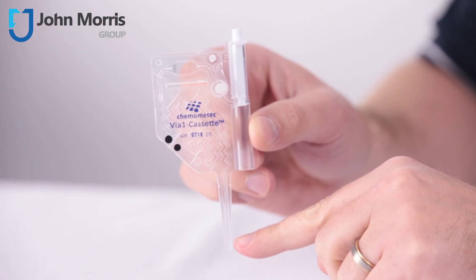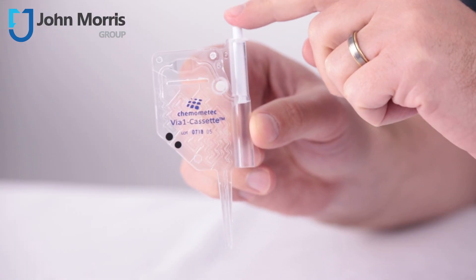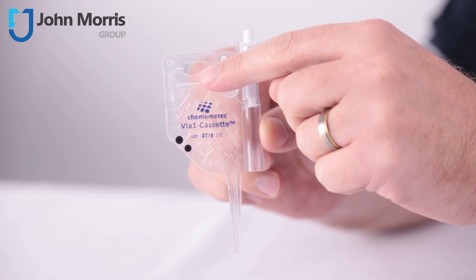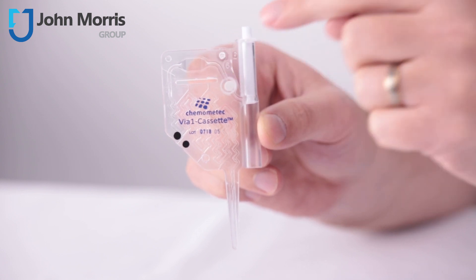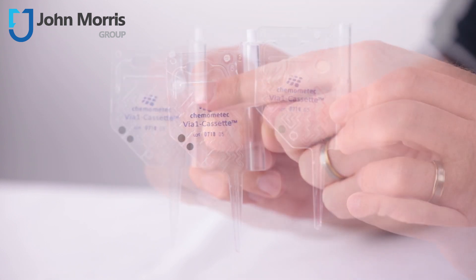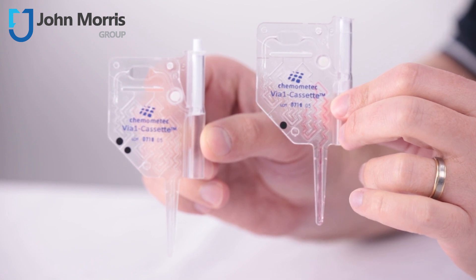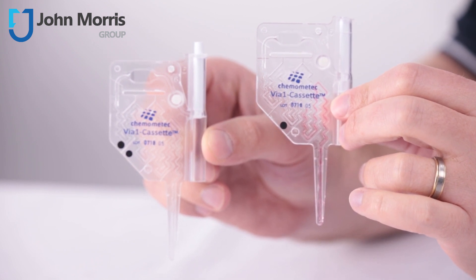So if your laboratory is looking for a very precise GMP, 21 CFR Part 11 compliant way of counting your cells with none of the issues associated with manual cell counting, pipetting or staining, we encourage you to take a closer look at the Viya 1 cassette from Chemimedic. You'll find a link to all the details and specifications about this unique solution below.